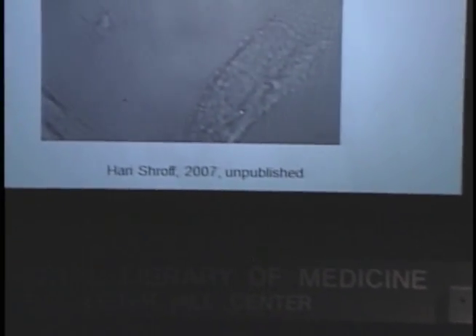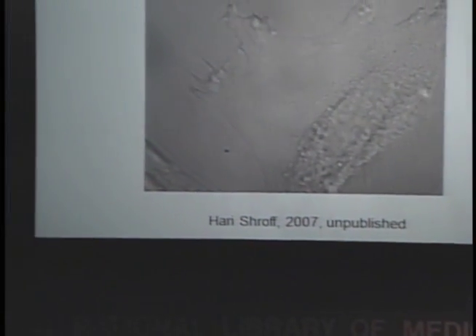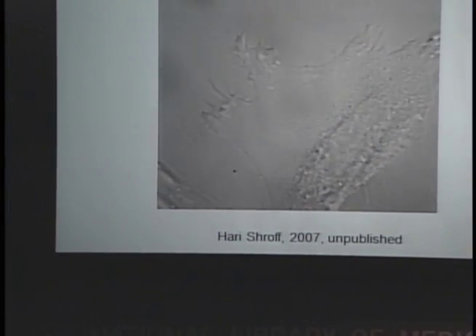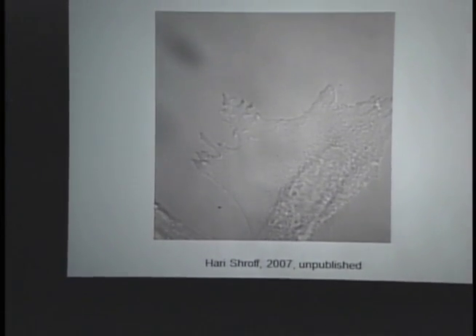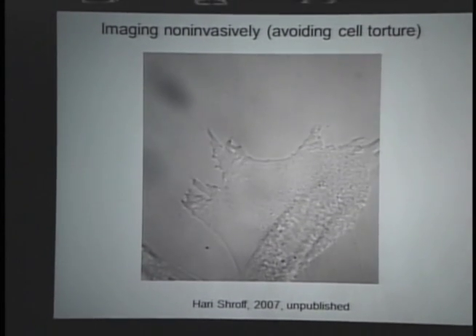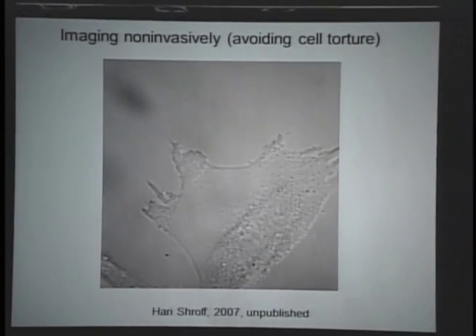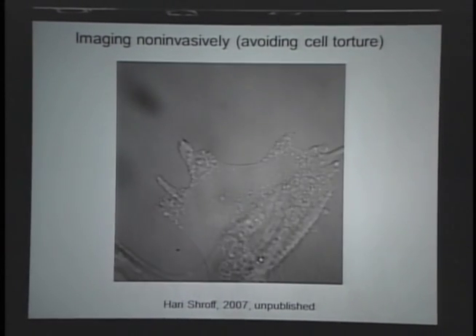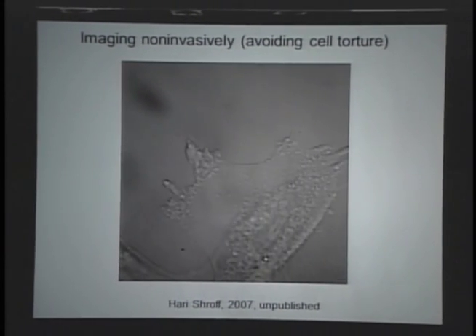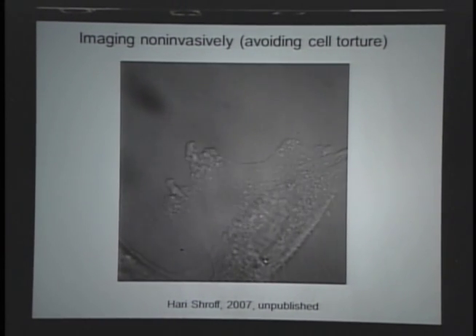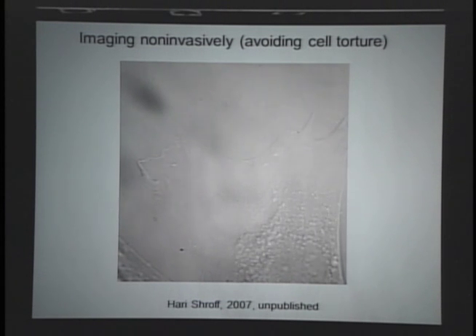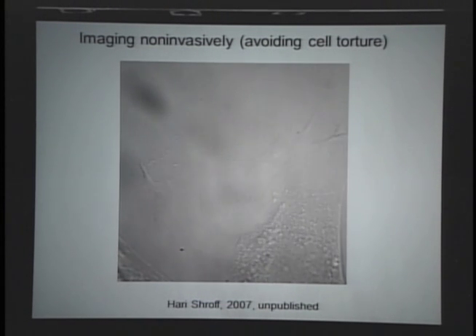One of the things I learned early in my tenure as a microscopist is that it's very easy to fry a single cell. Here you see a fibroblast cell cultured on a single coverslip. You're looking at it in bright field modality, but I was also shining a laser on this cell, and you can see it curling up. Eventually the cell would lift off the coverslip and die a watery death.